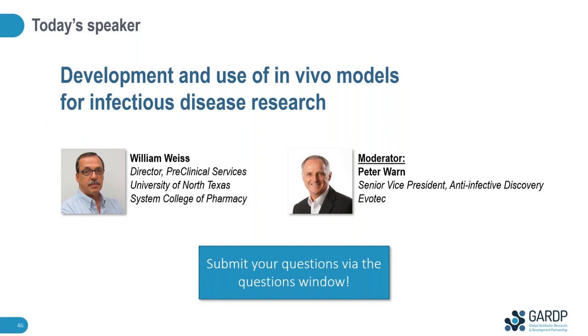Taking anything directly out of the freezer for use, after defrosting, obviously, the only thing I'd say we've done that with or recommend doing that is if you have a spore culture that you have isolated, like C. difficile spores, titered them, frozen down aliquots, you can bring those out, thaw them, and then use those directly.